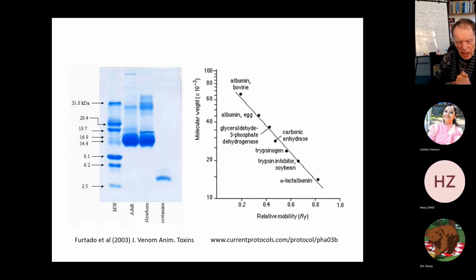A couple of points here. This is for proteins. So it doesn't work for polysaccharides. SDS, I don't think, binds to polysaccharides, or certainly not in a uniform sort of way. So it doesn't work for polysaccharides.